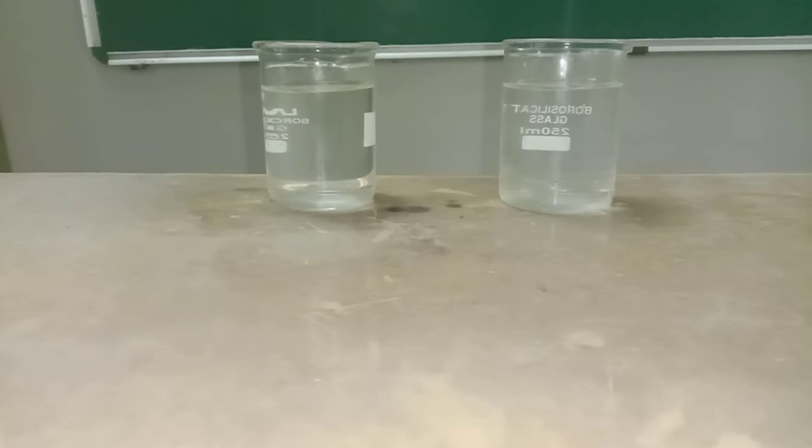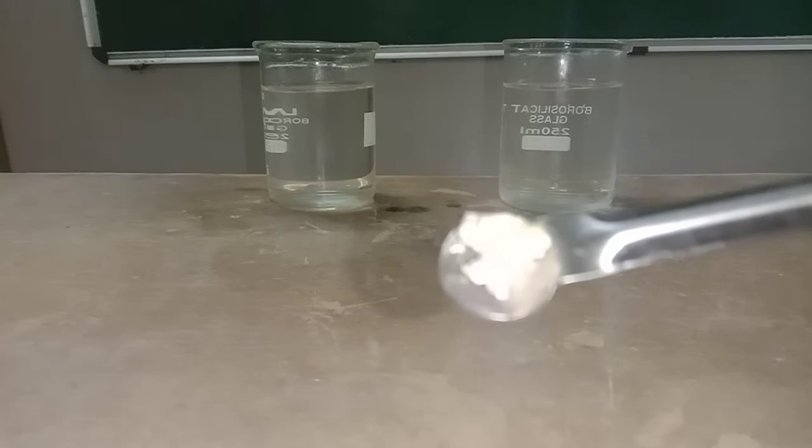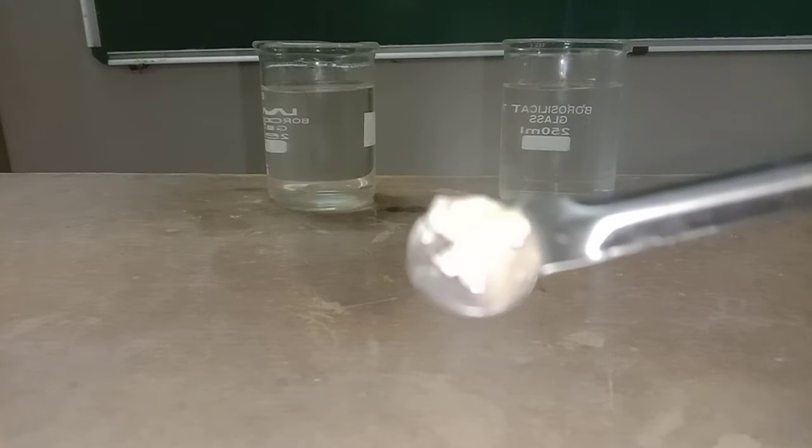Today we are going to discuss what will happen to the sodium metal when it reacts with the water. So you want to know how the sodium metal will be? I'll show. Now you can see, this is the sodium metal. You can see this is a very soft metal. You are able to cut it with a knife itself.